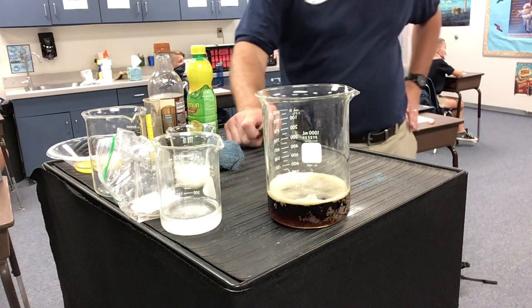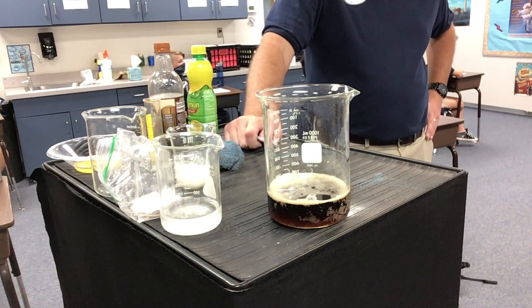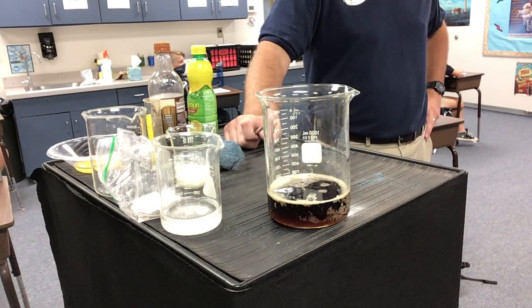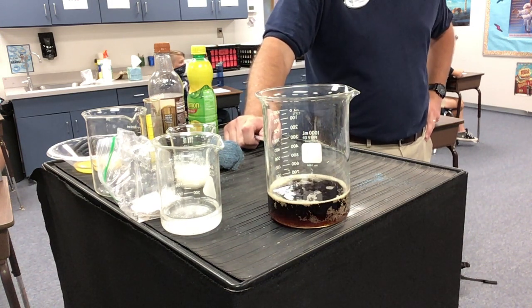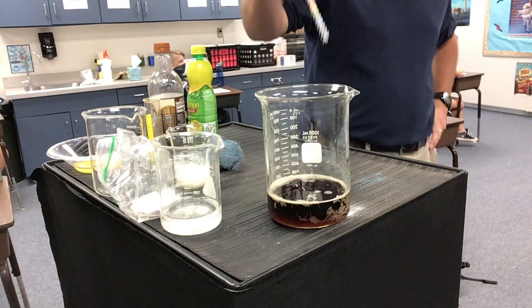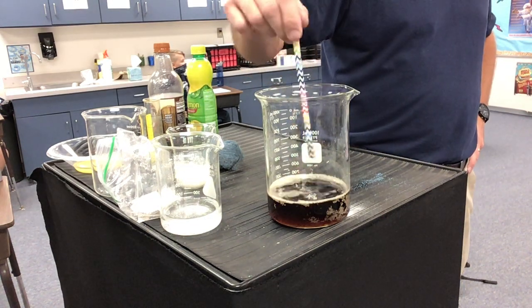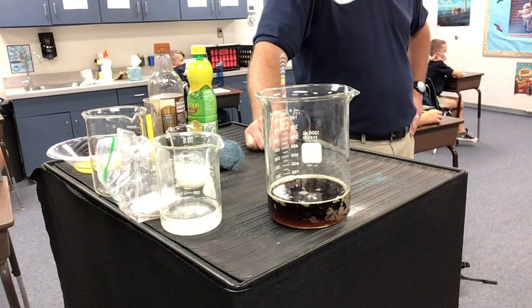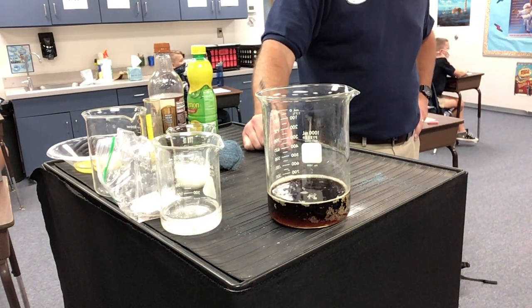Now, they're about gone. Okay. Is it changing color? Is it making more bubbles? Or is it just releasing the bubbles? Is it changing temperature?